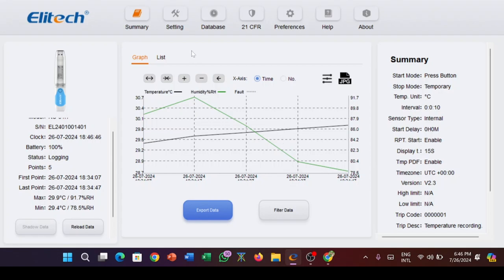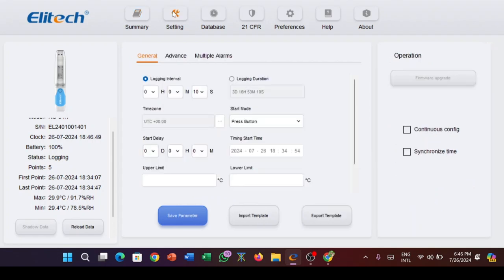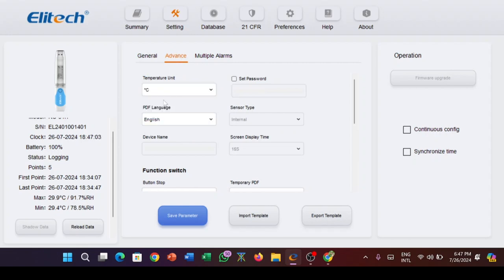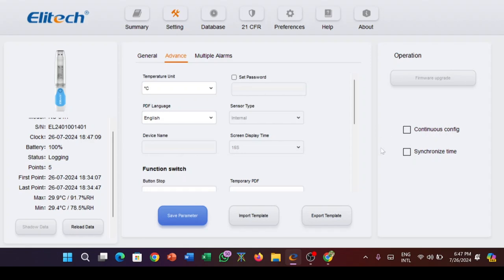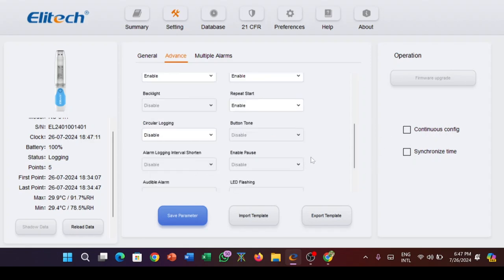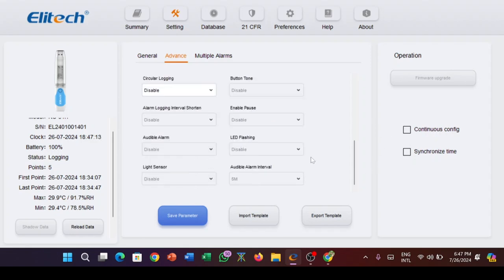To configure, open the installed Elitech software on your desktop and plug in your logger. Go to settings and access the advanced menu. Set the temperature to your preferred unit of measurement. The limit in this case I selected degree Celsius.